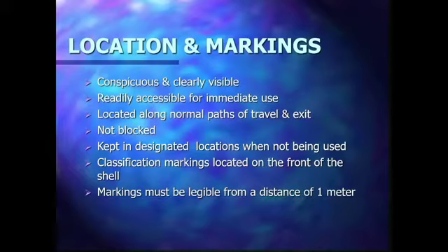Sometimes, in my experience, I found that fire extinguishers have not been maintained or properly located, and during an emergency, it is quite troublesome. We need to address the incipient stage, the small fire, first. If we have access to the fire extinguishers, we will be able to address the small fire. The incipient stage is a very, very significant stage for us to address before the fire breaks out.